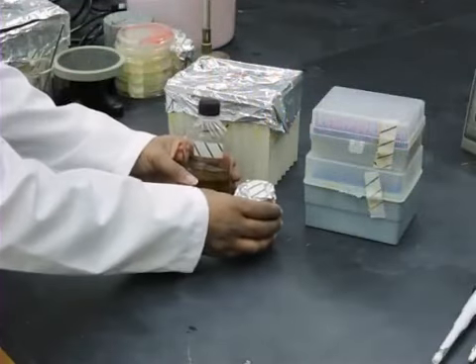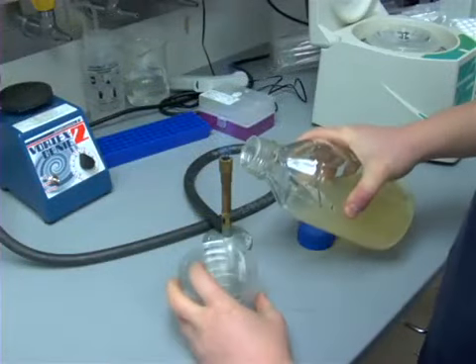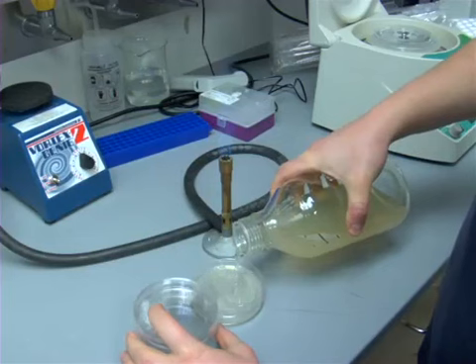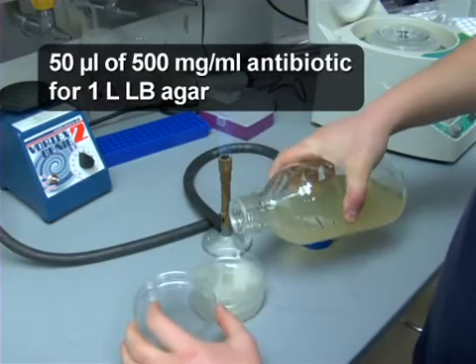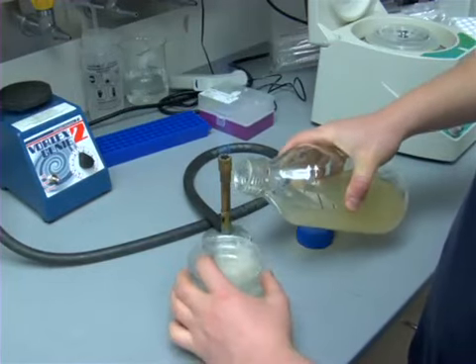Allow liquid media to cool to room temperature before use and let the agar cool to 50 to 55 degrees Celsius, the temperature at which antibiotic can be added and plates poured. Allow plates to cool to room temperature to solidify.